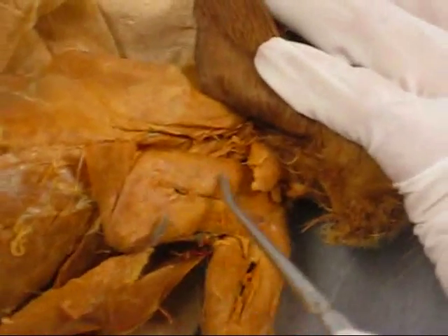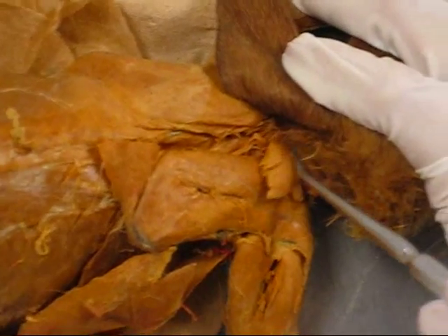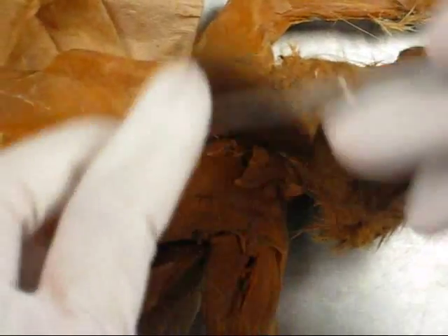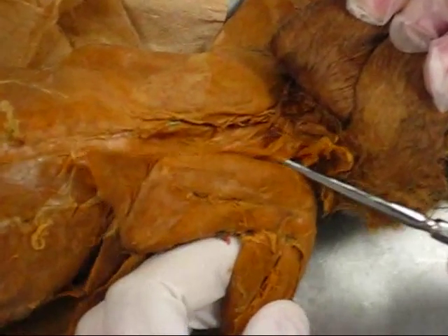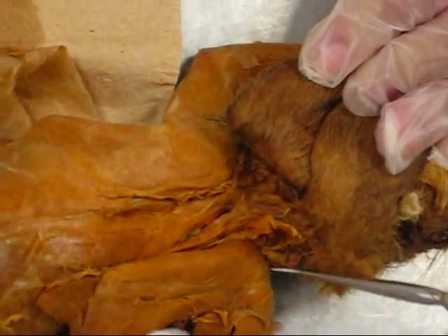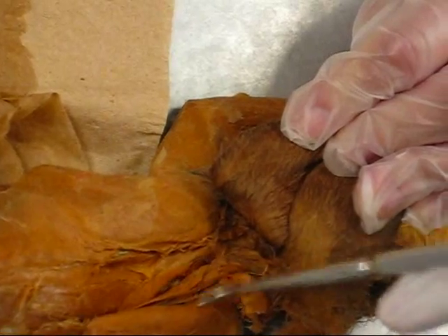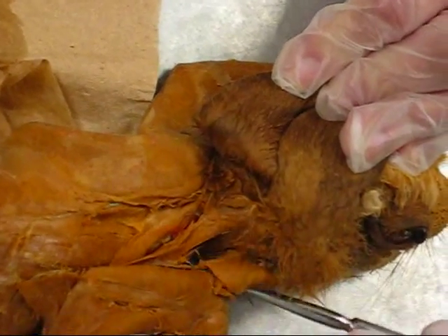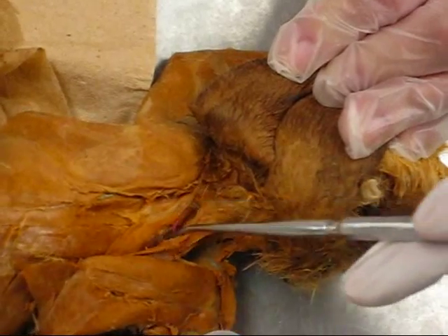Supraspinatus, infraspinatus, spinal trapezius, acromio trapezius. Rhomboidus, and underneath that the levators, scapulae dorsalis.